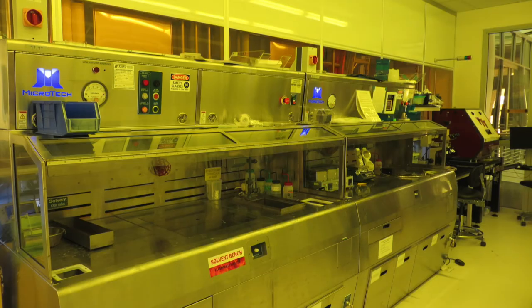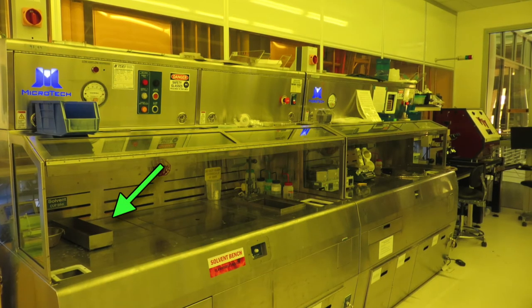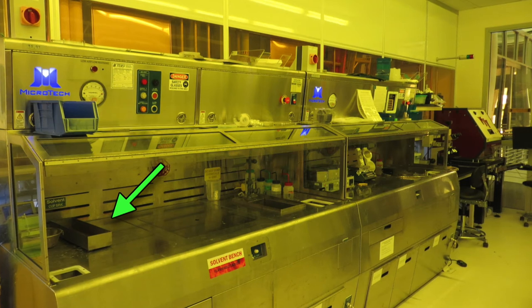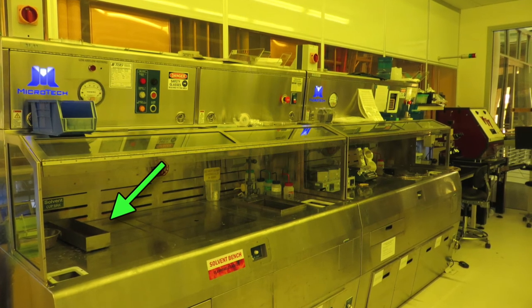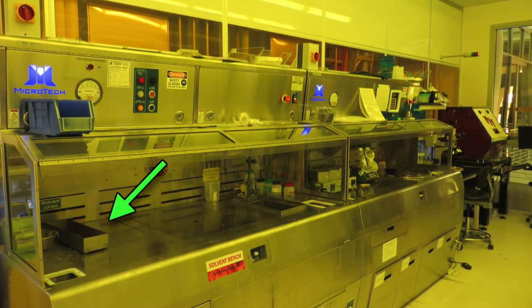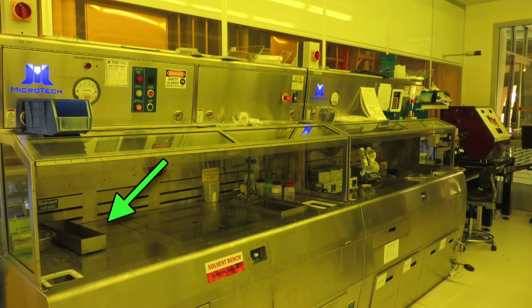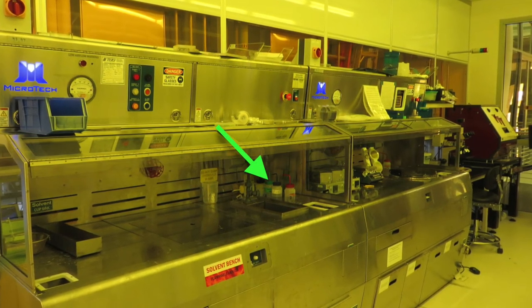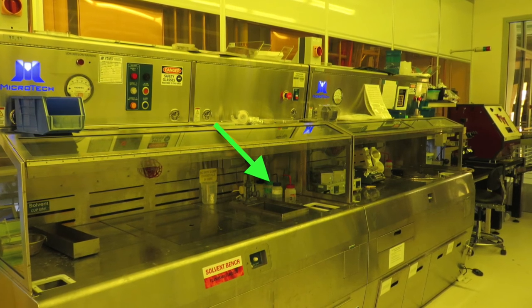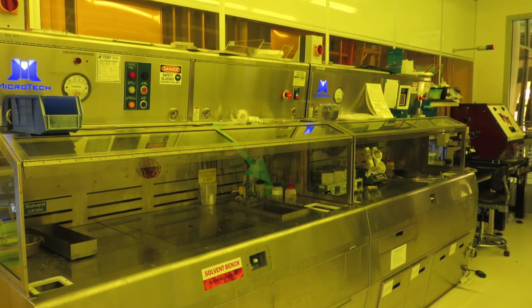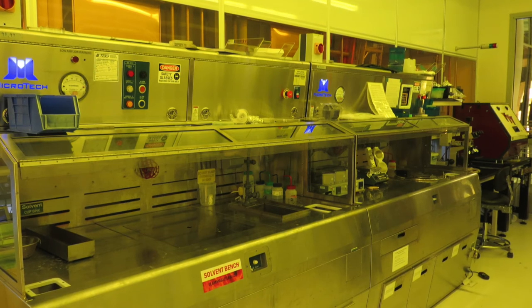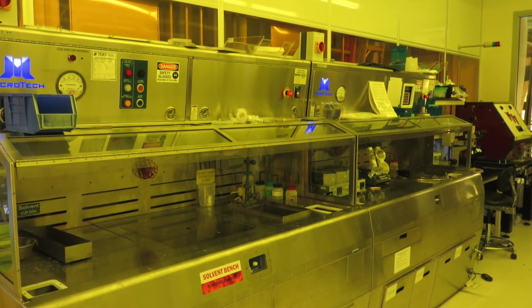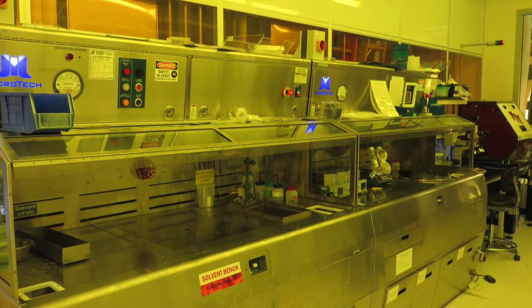Now we'll move on to the solvent bench. There is a carboy collection system for waste solvents, but I added an extender tray to make it easier to pour waste solvent into it or for use when rinsing off parts with a squeeze bottle. We provide acetone, 2-propanol, methanol, and n-solve which is a strong degreaser solvent. If you need to do any solvent based developing such as when developing SU-8, you would do that in this bench.